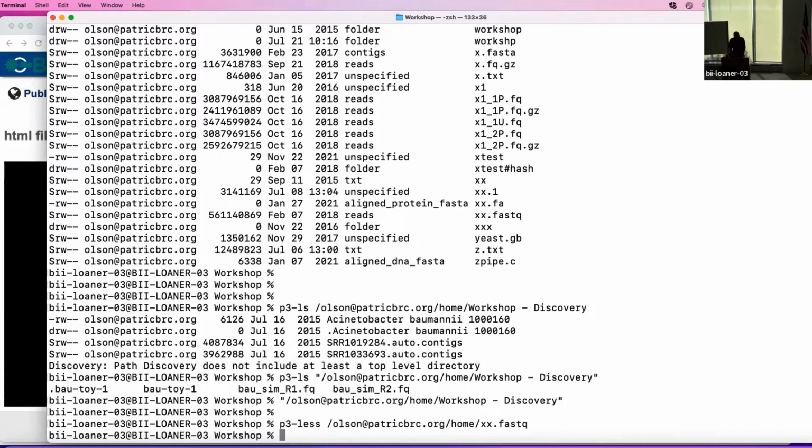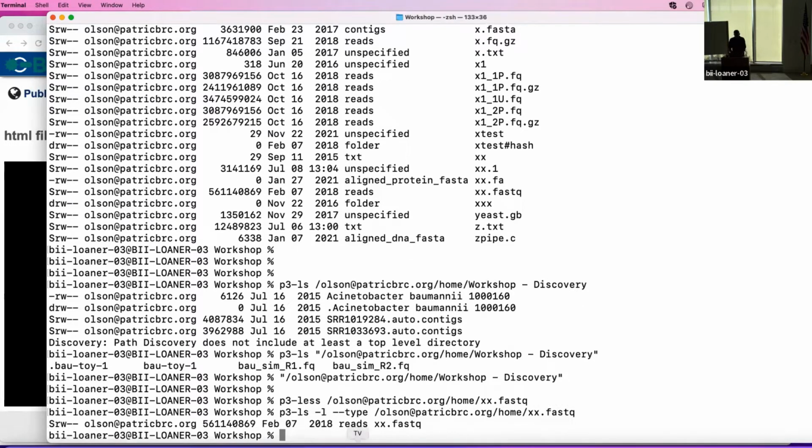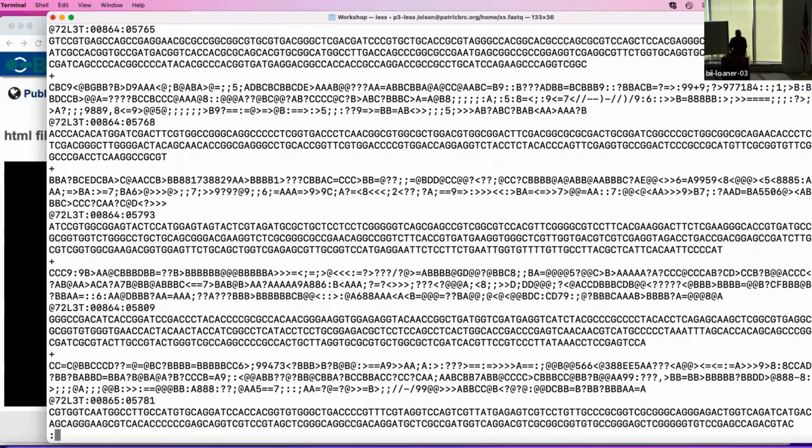Was that a reads file? Well, let's see. Let's take a look at what this file was. So this is a reads file. The structure of reads files, if you haven't looked at them before: this @ line is an identifier. Then we've got a line that's your actual read data. We've got a plus. Then we've got another line that is the same length as your read data, but this is an encoding of the read quality for that read.